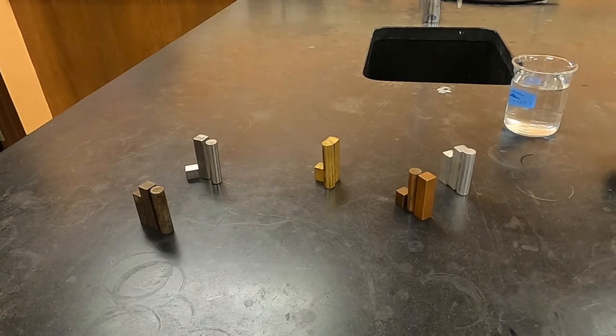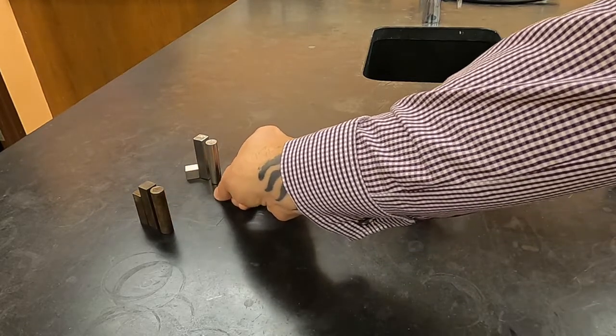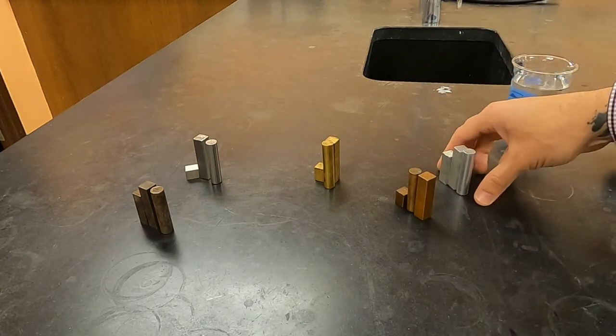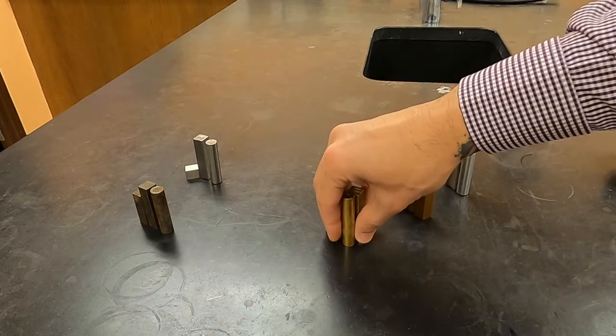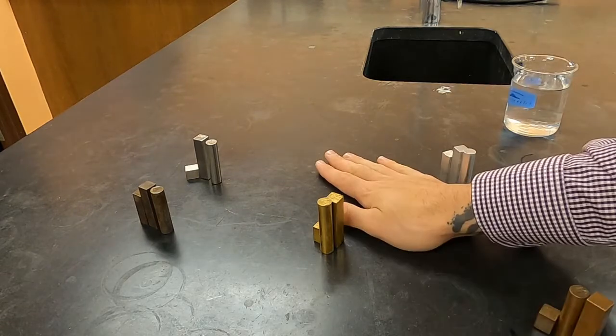Now, for this procedure, you're going to be getting 3 pieces of metal that are made of the same metal. Your options are steel, stainless steel, brass, copper, or aluminum. I'm going to do this trial with brass, and so I can get rid of the others.